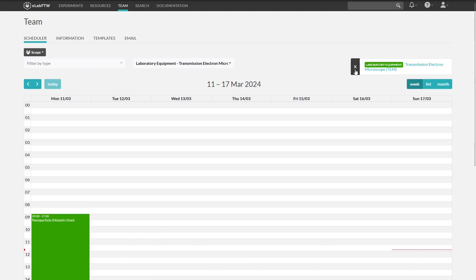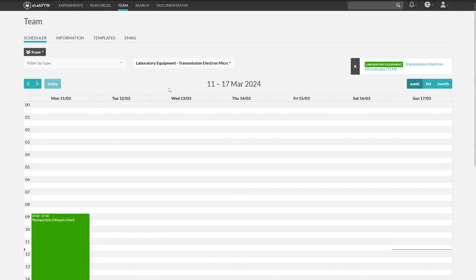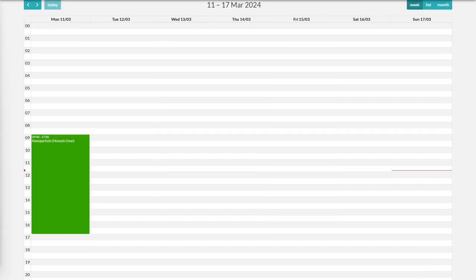At the top right, we can cancel the selection. Now we are looking for the period in which we want to book it. The red line shows the current time.